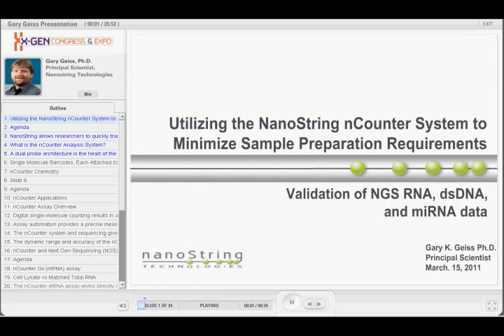Okay, so I'm Gary. I'm from NanoString, a scientist there, doing assay development. We are not going to talk about next-gen sequencing sample prep, but we are going to talk about sample preparation for use in our system.